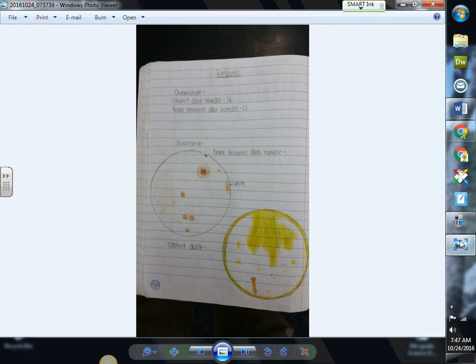Okay, welcome back. Last week we made some observations in our notebook. We made both quantitative observations and qualitative observations about the bacteria that we collected. Remember, the quantitative observations were the information about the numbers. We turned the data, the information in your Petri dish, into a number.